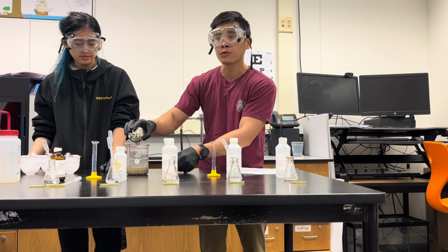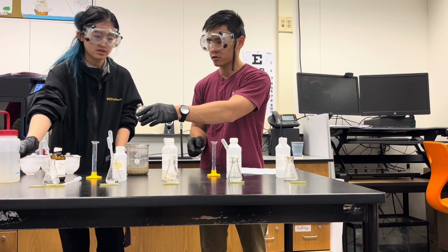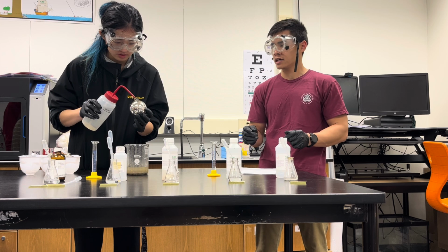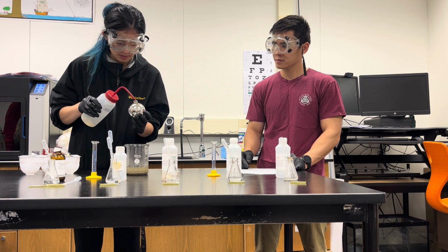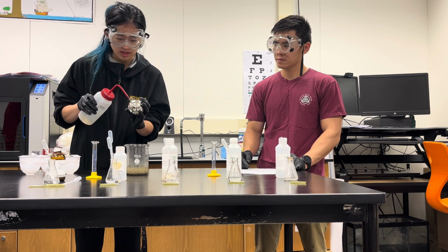And this last step, you can't use regular water. You have to use distilled water. What's the difference? Distilled water is deionized. Yeah, so basically in normal water, there's little particles called ions inside of it, which can react with the chemicals that we just put in here.